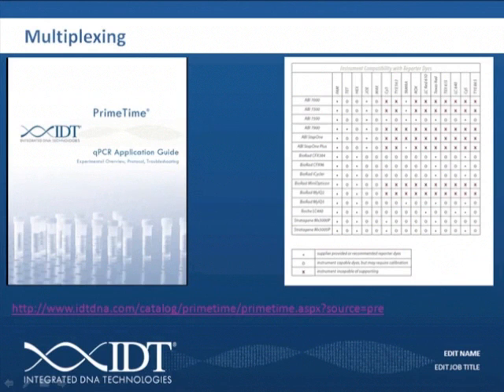But that is something that we come across quite often because people tend to pick sequences directly from a paper but are not cognizant of the fact that these may have been MGB probes, and they're shorter in sequence, and their TM may not be right for it to function optimally in an assay. So you need to keep that in mind when you're taking someone's paper and trying to recreate it, that it may be an MGB probe sequence. And we can work with it in the sense that we can find the best probe. We don't just need to lengthen the probe. We can find the best probe and use that for the assay.